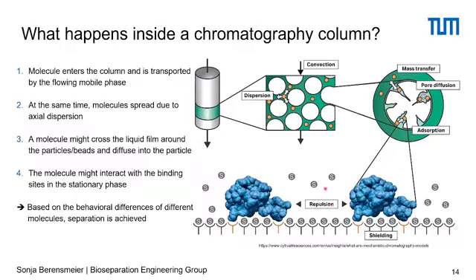But these are all effects that impact how long a molecule is on the chromatography column. And based on the different behavior of different molecules, we can achieve a separation. So this is the basic principle of chromatography.